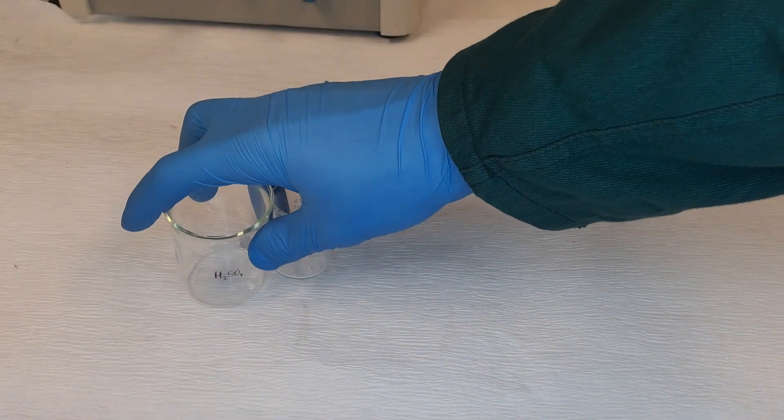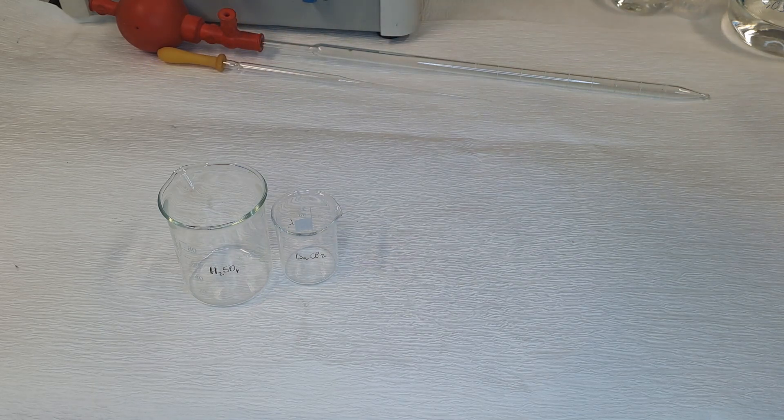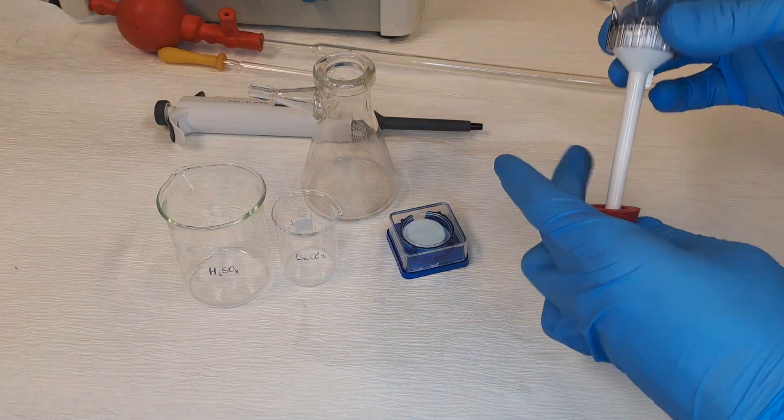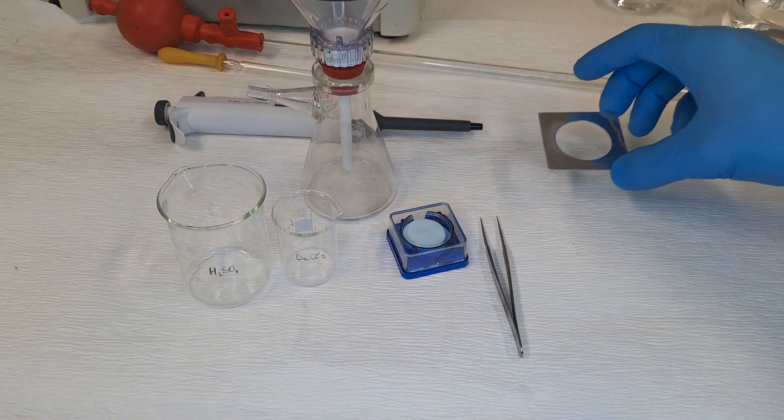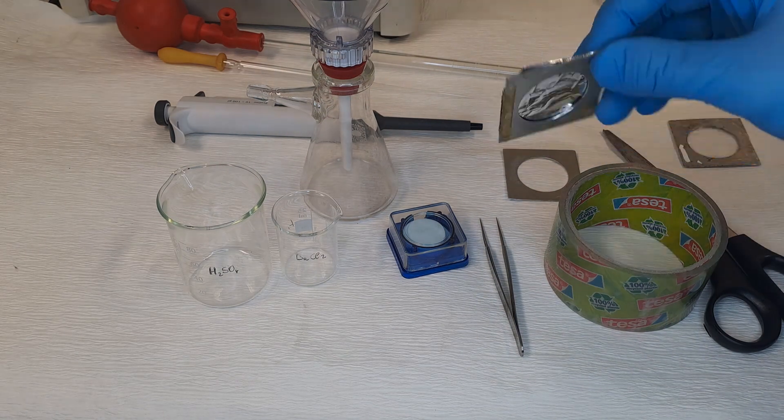Materials needed? Two beakers, a measuring pipette, a pasteur pipette, an assisting person with the micropipette set to 100 microliters, a buchner funnel with a membrane filter, tweezers, preparation frames, adhesive tape, scissors, and aluminum foil, and a heat lamp.